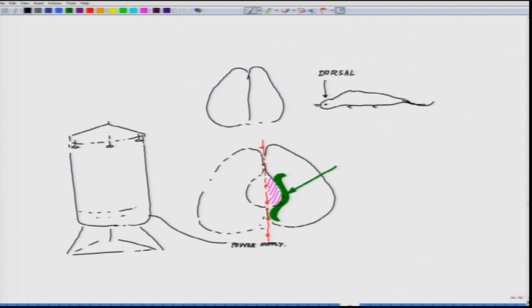Here you keep your stuff, and there is a pressure gauge which shows the pressure, and from here the water creates the vapor. So, in high pressure and a vaporized environment, you sterilize the stuff.